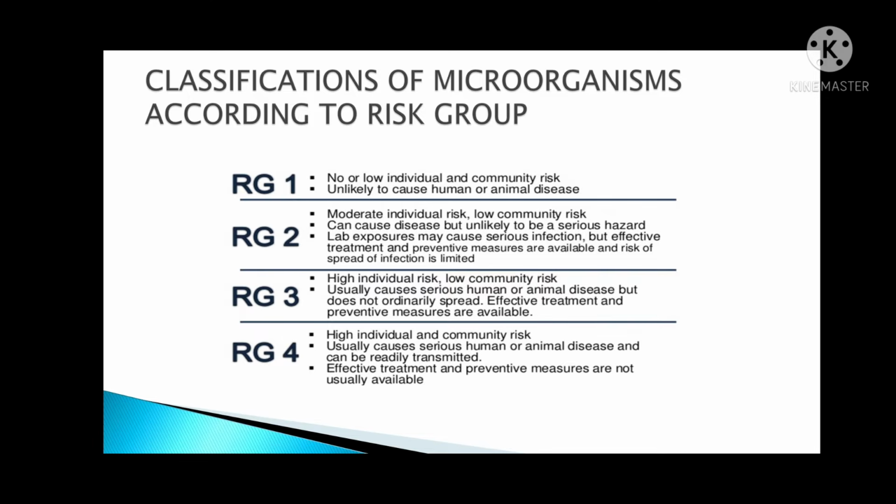Let's say, for example, a specific research project's biological risk assessment for the use of human immunodeficiency virus or the HIV, a risk group 3 agent, may correctly determine that HIV can be handled safely under biosafety level 2 conditions. Risk groups are designated from 1, which is the lowest risk, to 4, considered to be the highest risk. You may take a screenshot of this so that we can proceed to the next slide.